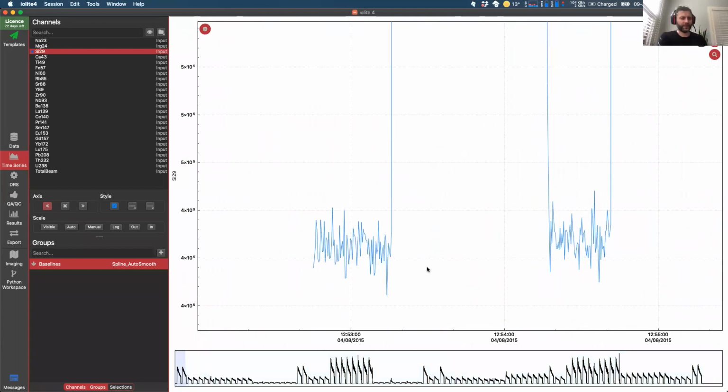And to manually create a selection, we hold down the Control key on Windows and the Command key on Mac, and we click and drag a box. So I'm holding down the Command key, and you can see that it adds this box. To start off with, the box has a red outline with a dashed line defining it, and it has a green line running through it at the moment.